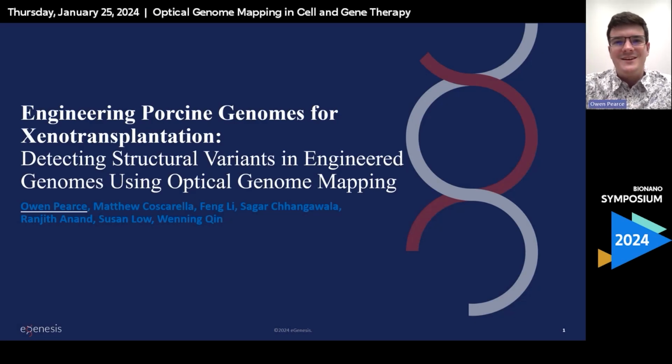My name is Owen Pearce. I am a Senior Research Associate at eGenesis, and today I'm going to be talking about engineering porcine genomes for xenotransplantation, detecting structural variants in engineered genomes using optical genome mapping.